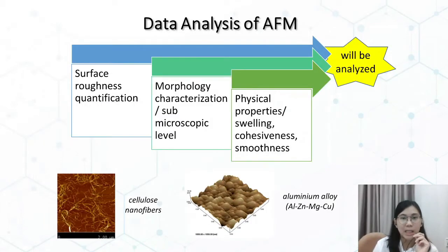AFM is a powerful technique that enables the imaging of almost any type of surface. The analysis provides images with near atomic resolution for measuring surface topography.